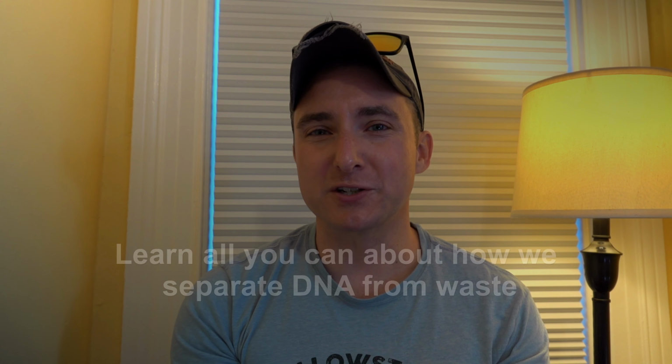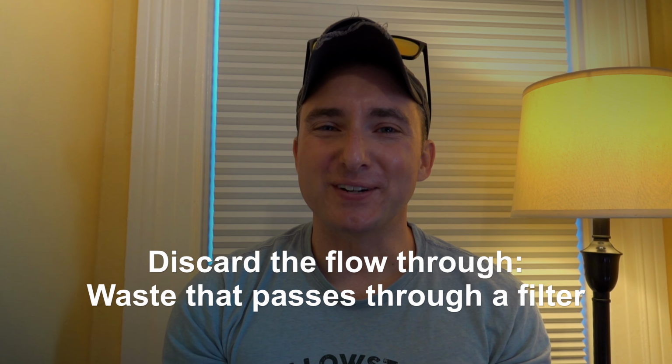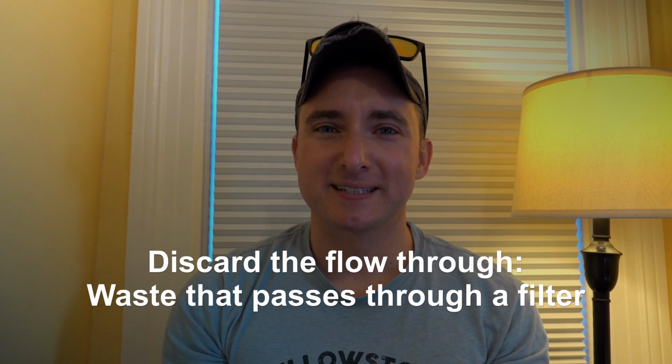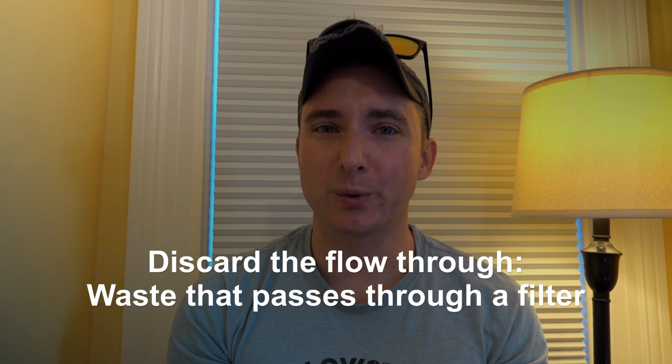All modern DNA extraction techniques work by allowing us to separate the DNA that we want from mixtures of waste, whether they're semi-solid wastes or liquid wastes. The first technique that we're often asked to do is discard flow-through. Now, flow-through in modern DNA extractions is the liquid that comes through a filter and ends up in the bottom of a tube, and you just got to get rid of that. So the phrase discard the flow-through tells you right away that your flow-through has the waste and you want to get rid of it, and your DNA is somewhere else, probably stuck to a filter somewhere or in a separate tube. There's a right way and a wrong way to do this.